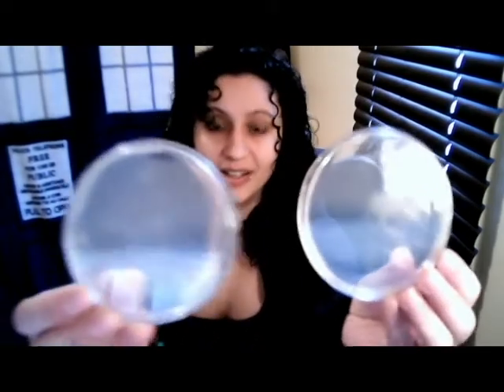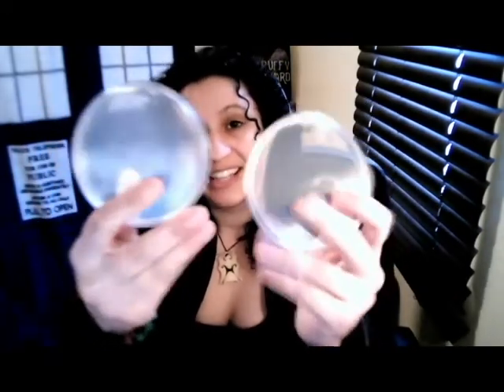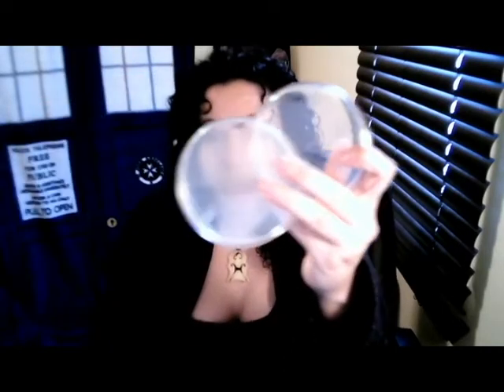Here is a starch hydrolysis plate, an SHA, and here's a TSA, which is tryptic soy agar. So as you can tell, they look almost identical. It's very hard to tell them apart, but the thing is that sometimes Catherine will leave these labels on them, and then you'll be able to tell the difference.